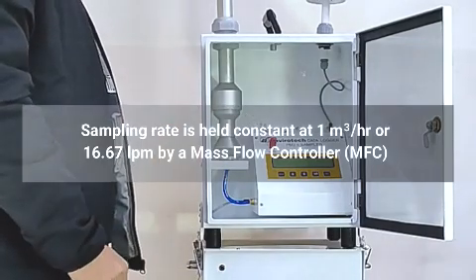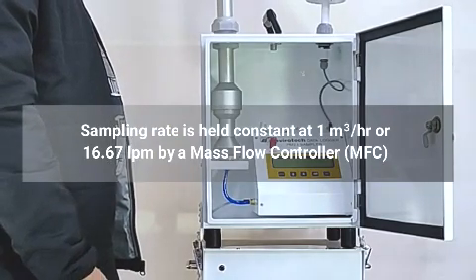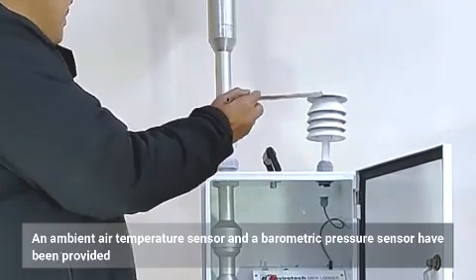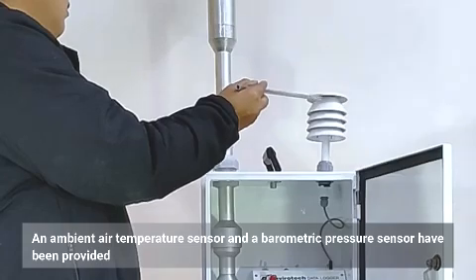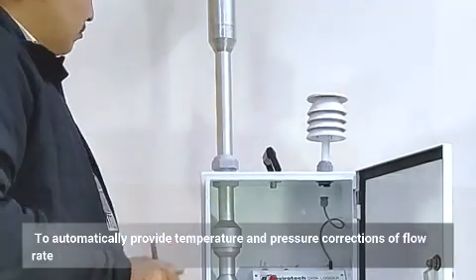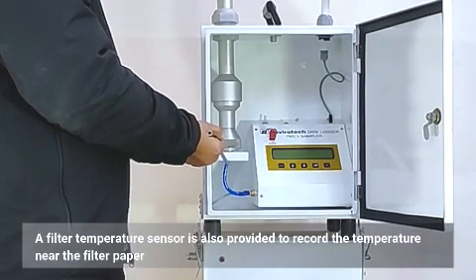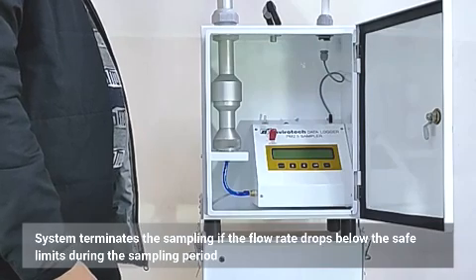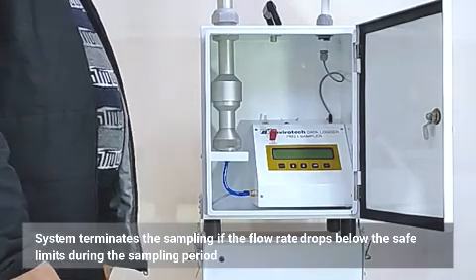Sampling rate is held constant at 1 cubic meter per hour or 16.67 liters per minute by a mass flow controller, MFC. An ambient air temperature sensor and a barometric pressure sensor have been provided to automatically provide temperature and pressure corrections of flow rate. A filter temperature sensor is also provided to record the temperature near the filter paper. The system terminates the sampling if the flow rate drops below the safe limits during the sampling period.